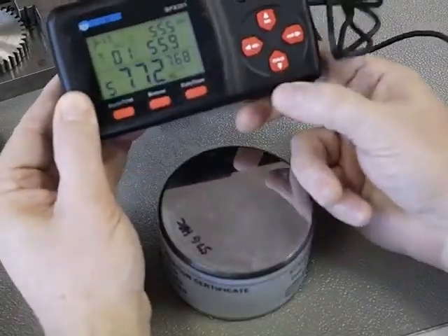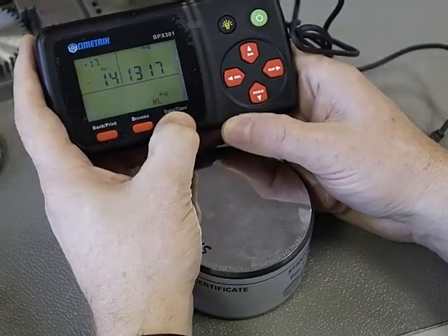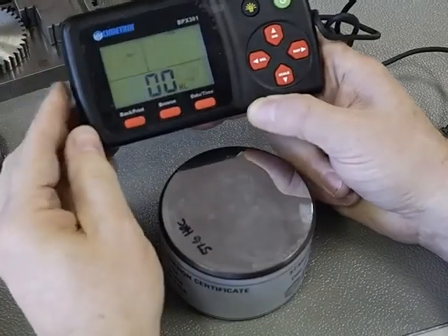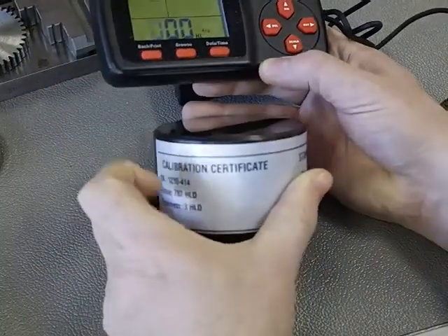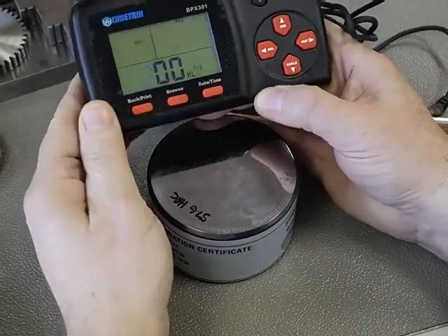What we're going to do now is go into our date time button and hold it down for 2 or 3 seconds until the display flashes and it changes. All we need to do now is type in the 787 number that is for this particular block.